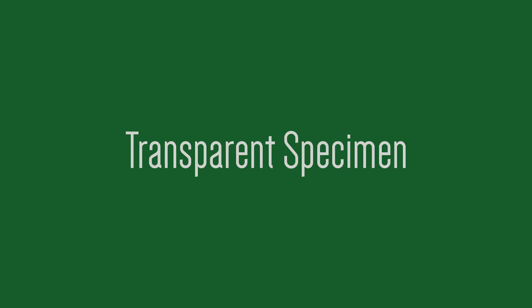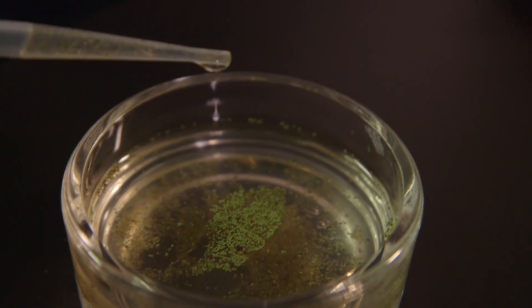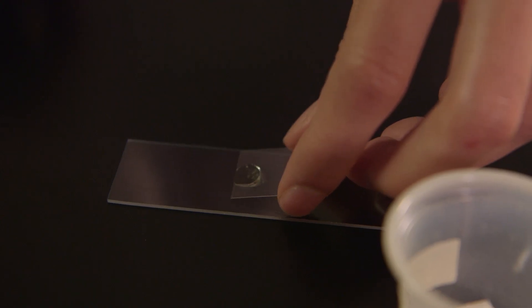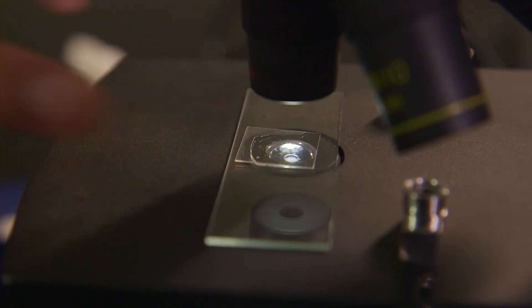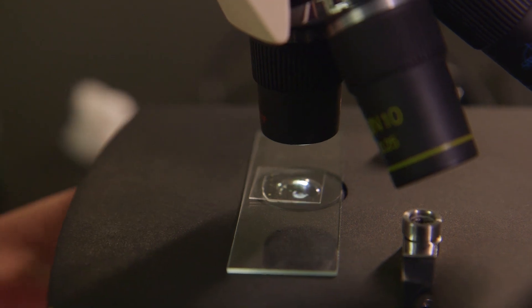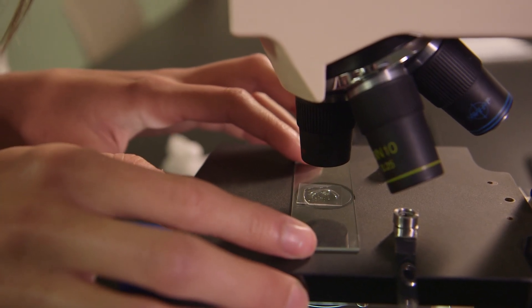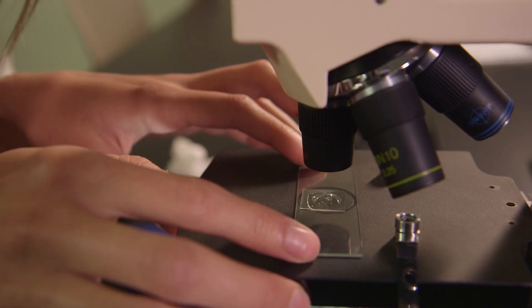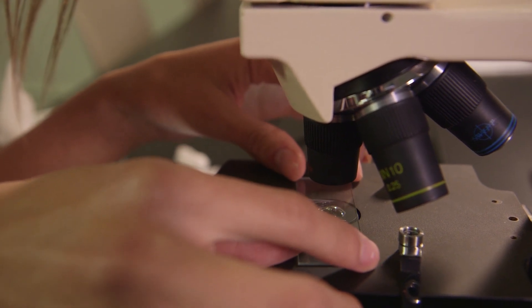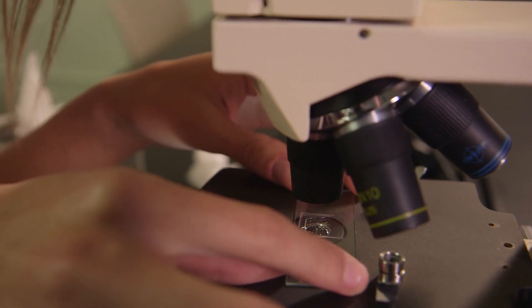Now we're going to look at a transparent specimen. Obtain a drop of pond water from the bottom of the culture dish where there is a concentration of organisms. Place the drop in the center of a clean glass slide. Lower the cover slip over the drop of water at an angle. Place the slide on the stage of the microscope and focus it using scan power, with the diaphragm closed to its smallest diameter. Scan the slide by grasping each side of the slide with your thumb and index finger, moving the slide slowly up and down and from side to side while observing the sample through the ocular. This is called scanning, and it allows you to rapidly explore the entire area under the cover slip.